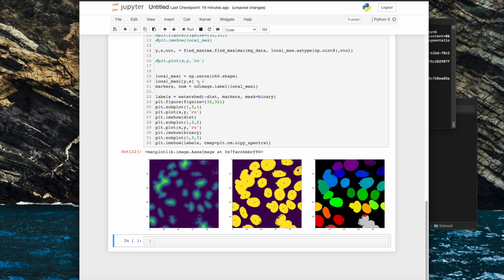Great. So you can see here on the right hand side, it hasn't done a perfect job of separating our cells, but it's done a much better job than it was before. So these cells, which were very close and sort of overlapping, are now separated. This is better than nothing, but it's not perfect. But generally this is good enough for getting a quantitative measure of what's happening.